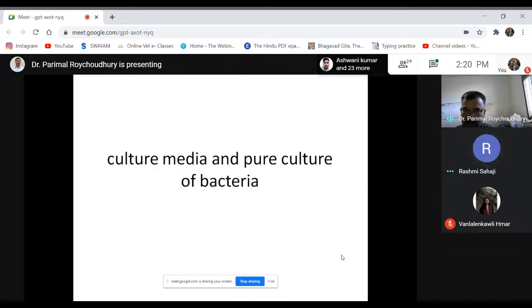Culture media and pure culture. Okay, fine. Thank you. So in the last couple of classes, we were discussing the basic techniques that we use in a microbiological laboratory for handling and identification of organisms, and our main focus is towards the study of bacteria. Gradually we'll shift to fungi and then to viruses at a later part.